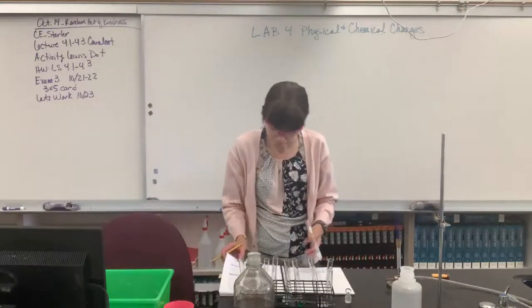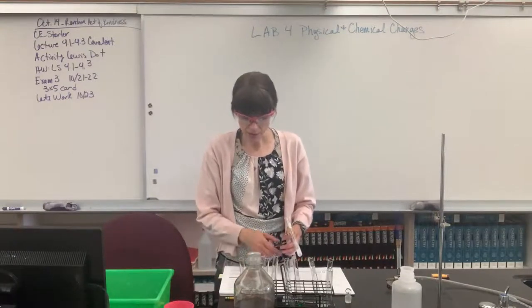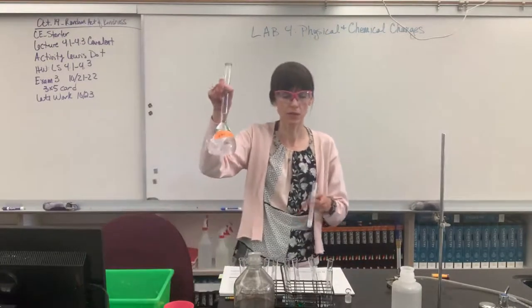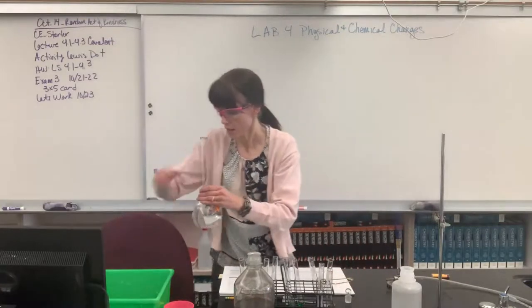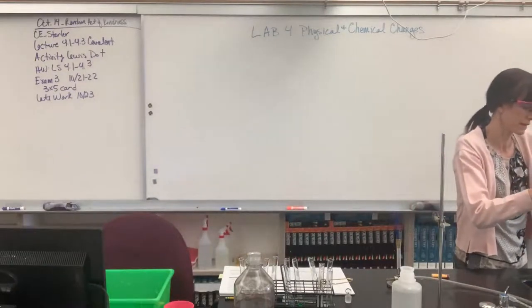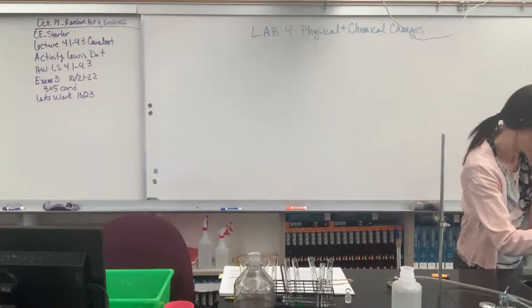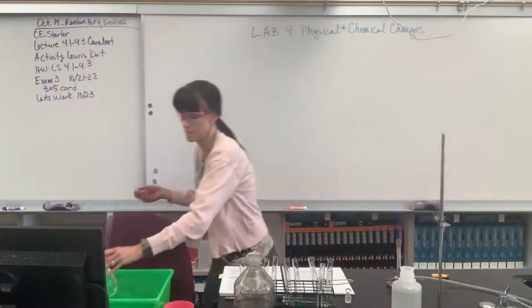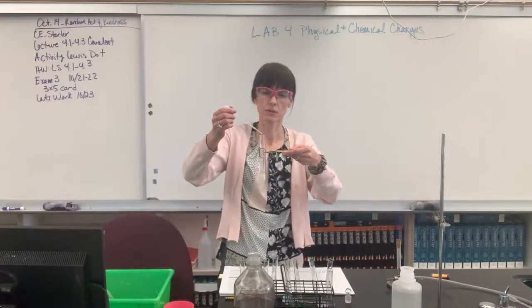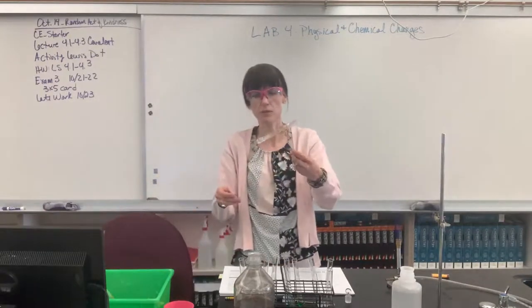Now it says on number 7, test the resulting solution by adding 6 drops of the calcium nitrate. So here is my calcium nitrate. Let me set that down for a moment. I'll go ahead and get 6 drops. There we go. Okay, let's see what happens. We're going to put 6 drops. 1, 2, 3, 4, 5, 6. And I'm going to swirl this around with my solid.